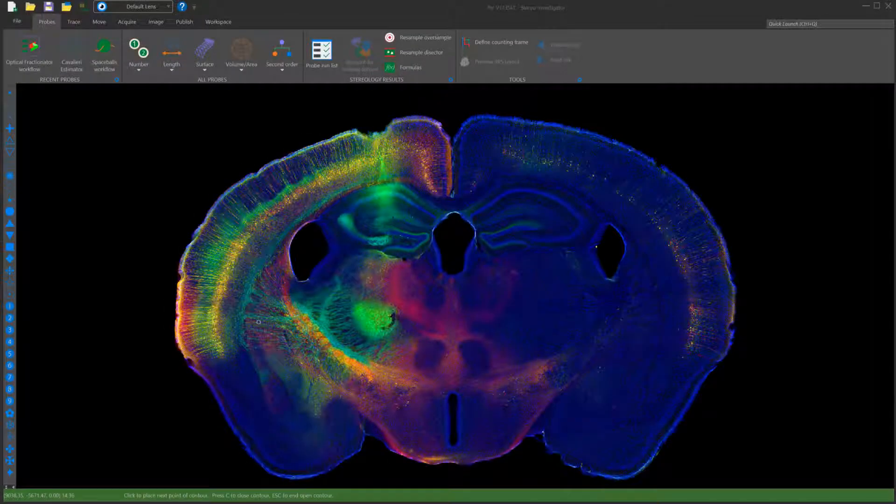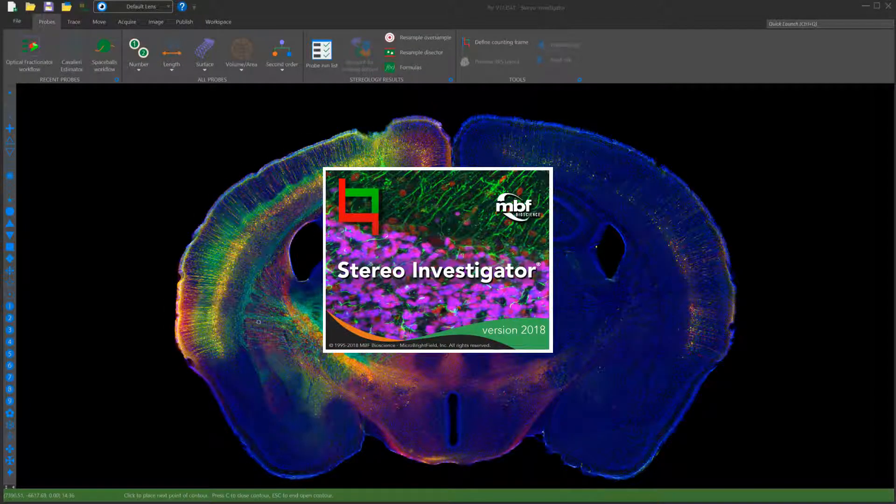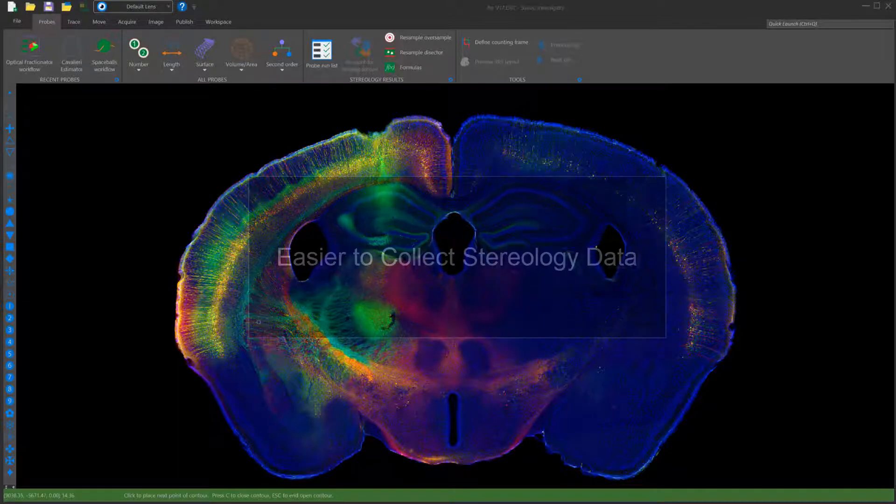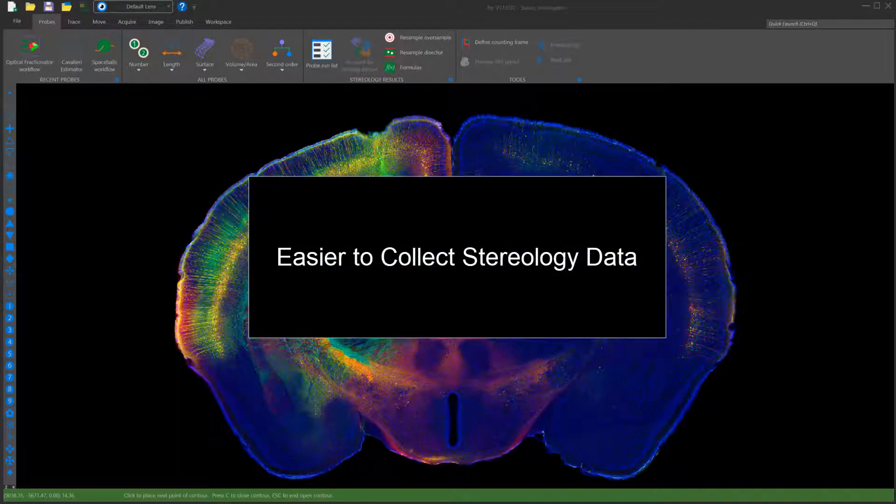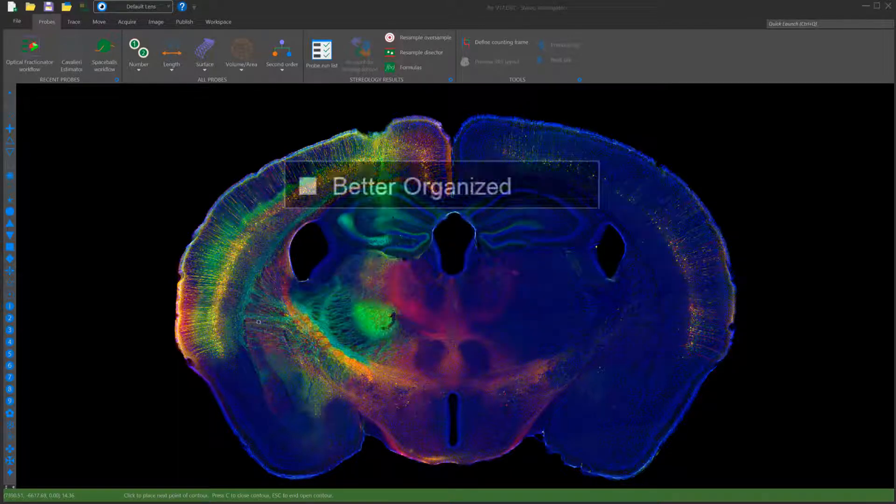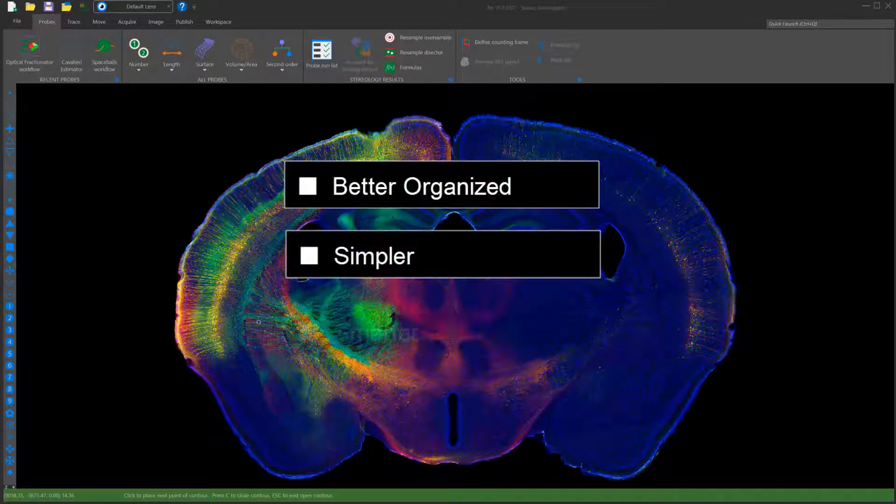Welcome to StereoInvestigator version 2018. The completely redesigned StereoInvestigator makes it easier to collect stereology data. The software is better organized, simpler, and smarter.